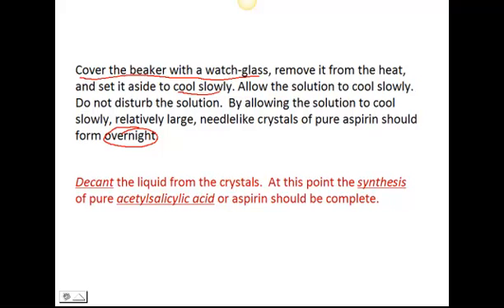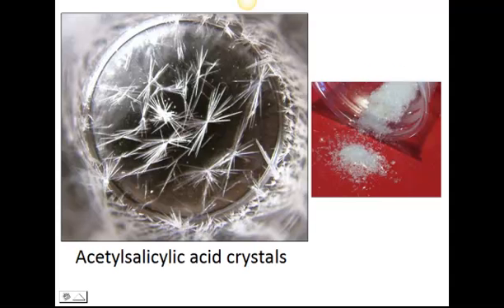By allowing it to cool slowly without disturbing it, you're going to get large, shiny, needle-like crystals of pure aspirin. Once we get this pure aspirin, we have more steps to go through — more decanting, more filtering, more weighing. But we have created our pure aspirin. It can be partly identified by the appearance of these long, shiny, needle-like crystals. This is one test of purity, and this is what we hope to achieve in our first synthesis.